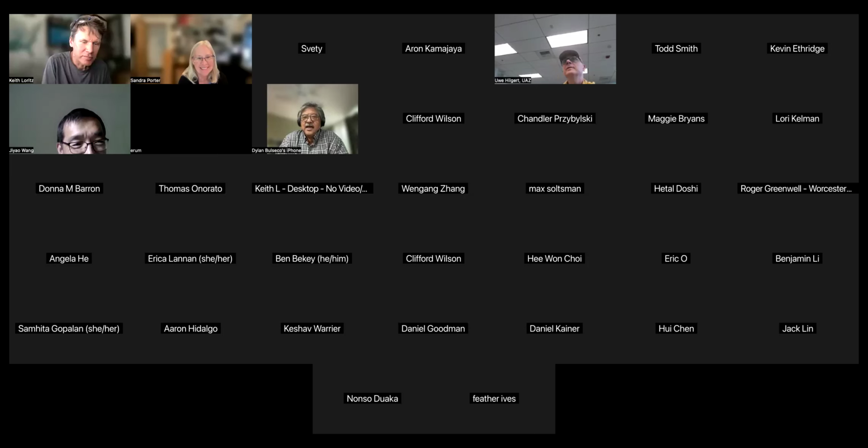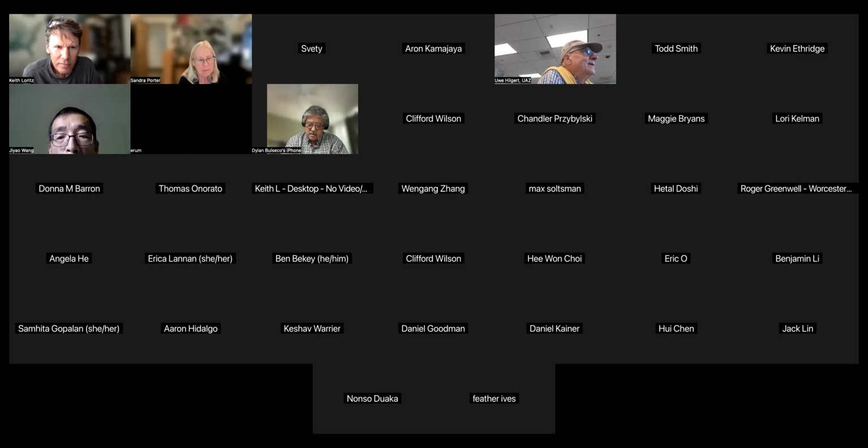Is it possible? I didn't realize you could do the ligand protein interactions. Is it possible to load ligands from PubChem? Yes. You can load a PubChem compound through the PubChem CID or compound name. I think we recently added that you can input compound name or SMILES, InChI as well.